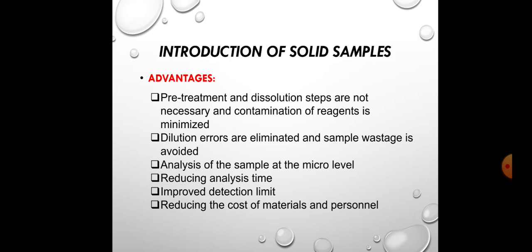Because we don't need to dissolve the sample, we just weigh the sample, powder for example, and put it directly into the atomizer. Another advantage is that analysis of the sample at the micro level is possible, reducing analysis time, improving detection limit, and reducing the cost of materials and personnel. So you don't have to spend time making solutions or dissolving the sample.